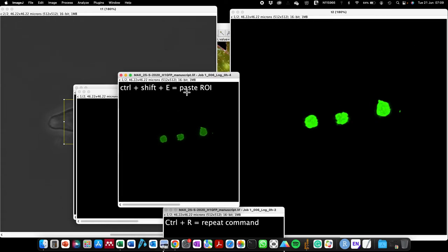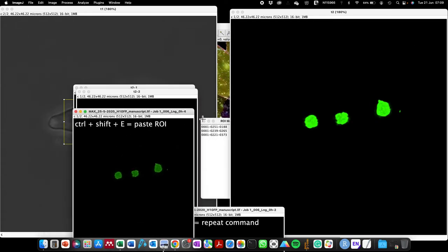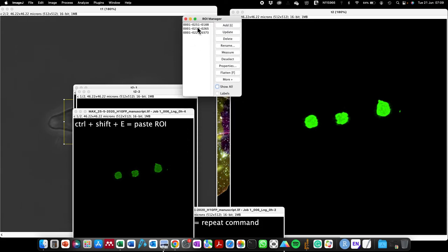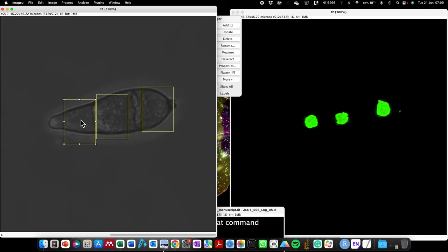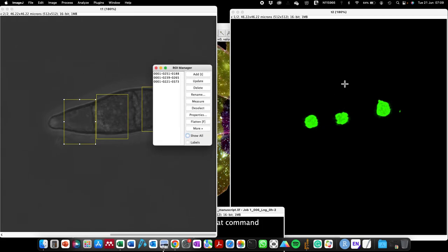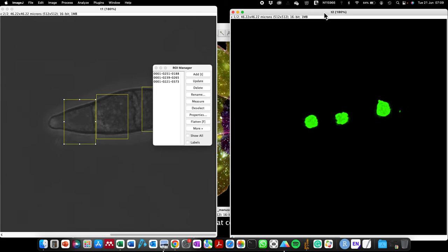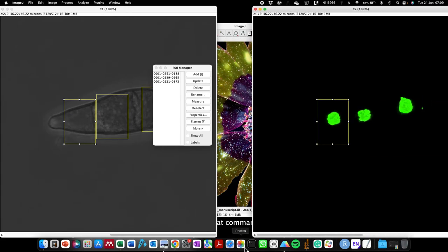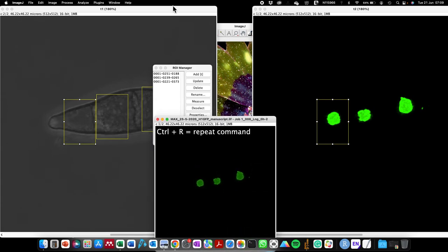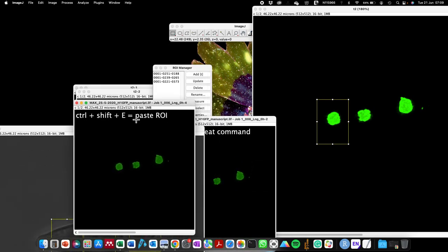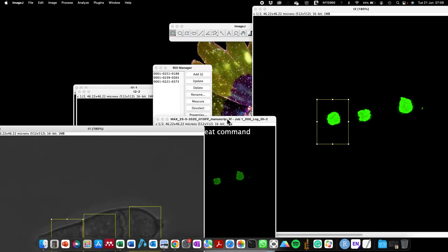I'm going to close that. Also, instead of coming to the ROI Manager to paste your region of interest — let's say I'm interested in pasting this first region of interest on a different image that doesn't have it — I just use Shift + Command + E to paste that. That's how to paste your region of interest onto an image.